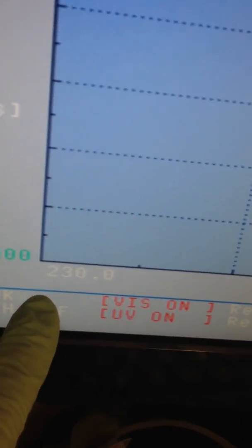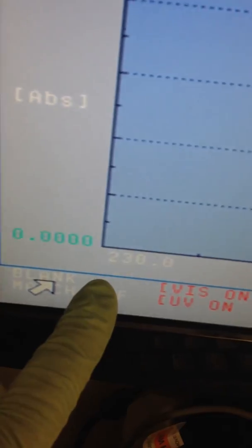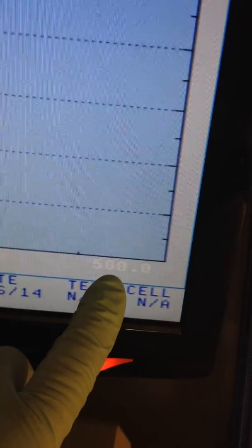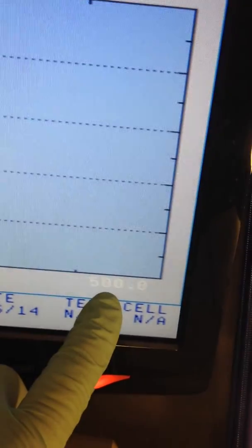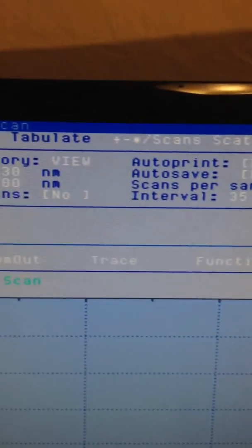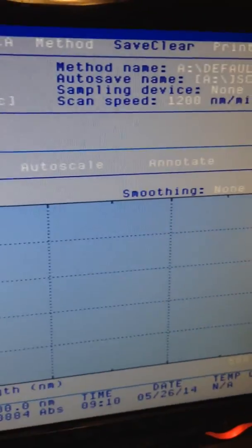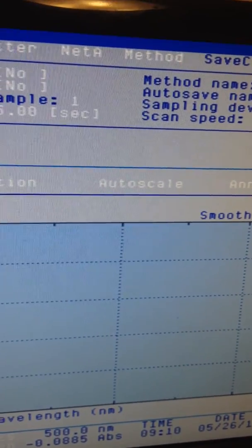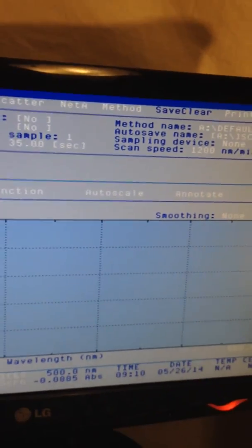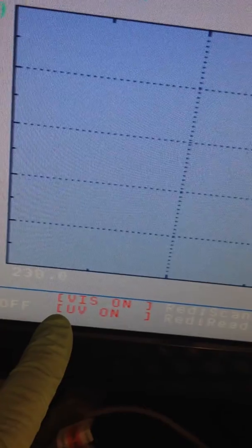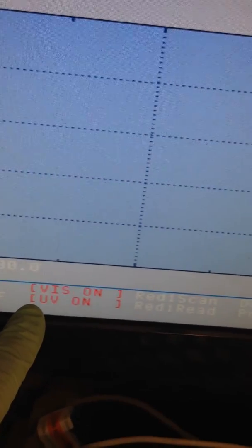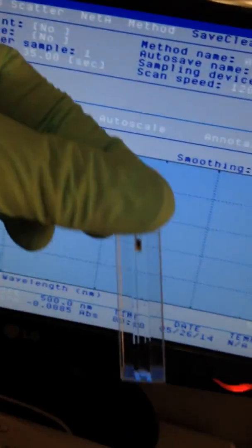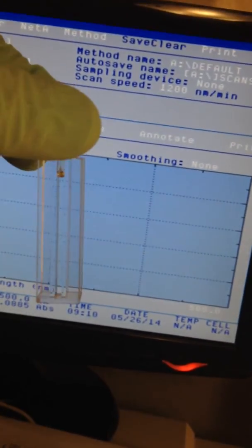You can scan from 190 nanometers to 1100 with this instrument. As you can see, both lamps are on. We use a cell with a very dilute solution of sodium chromate and place it in the instrument.